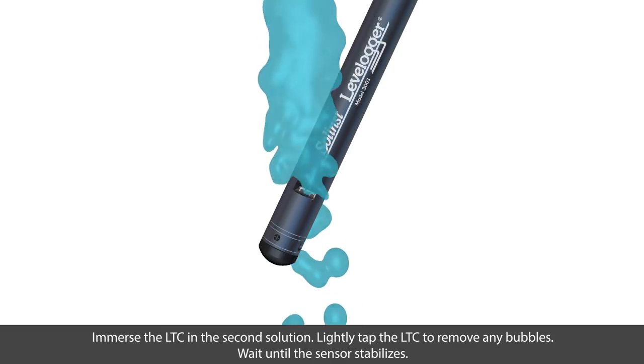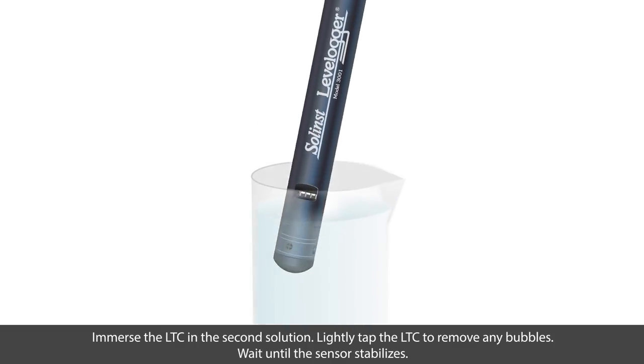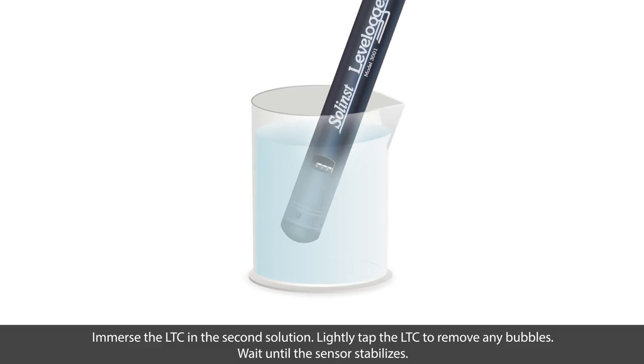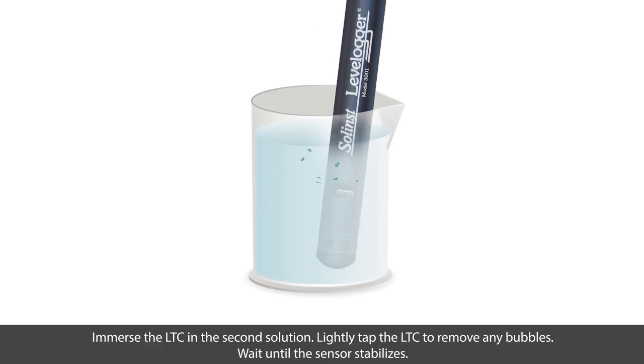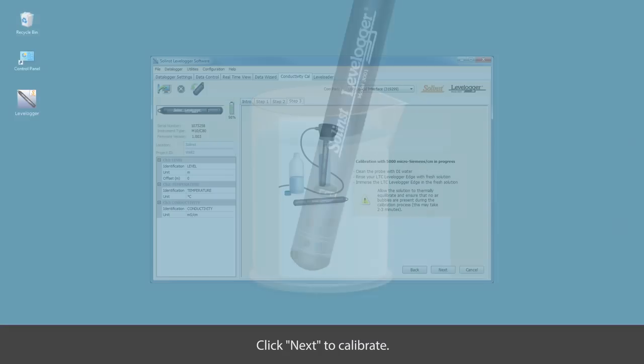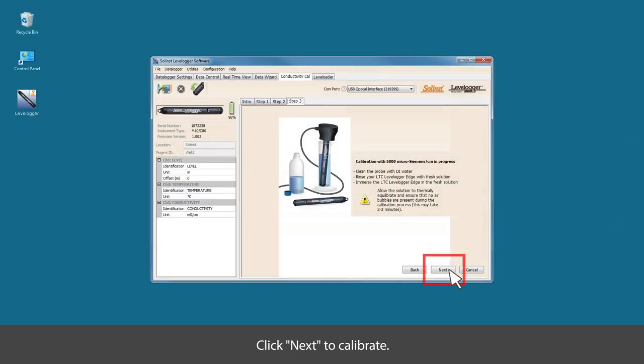As before, you'll want to lightly tap the LTC to remove any bubbles, and then wait until the sensor stabilizes. Click next to calibrate.